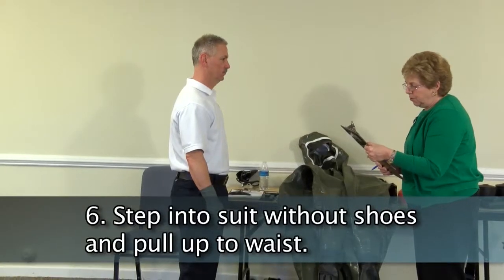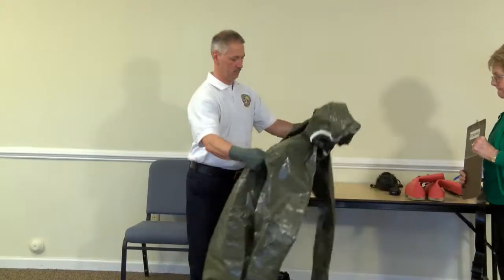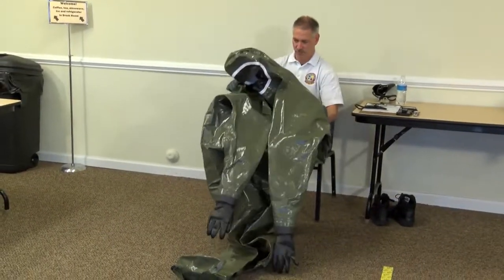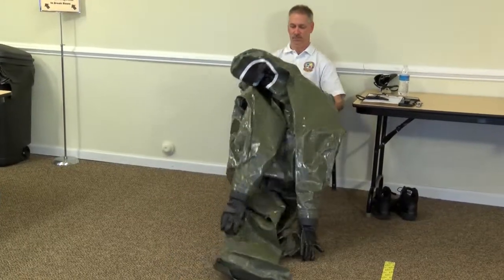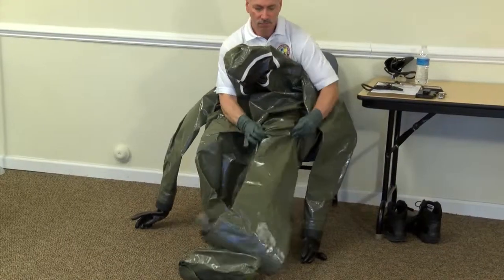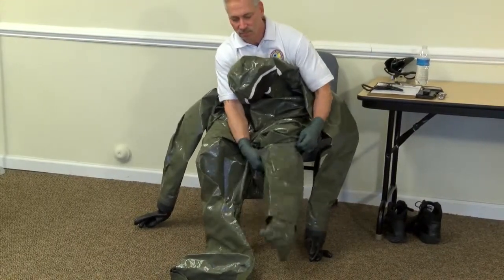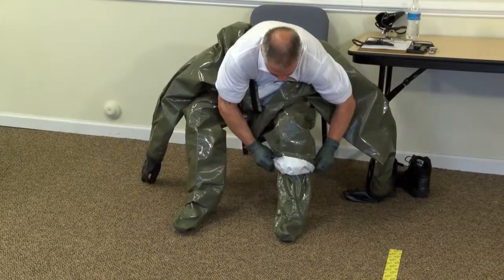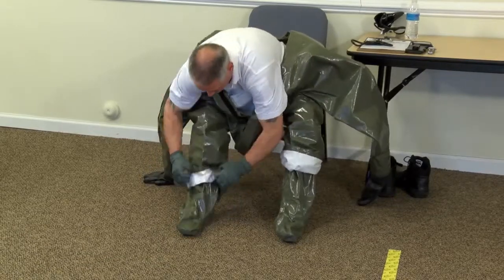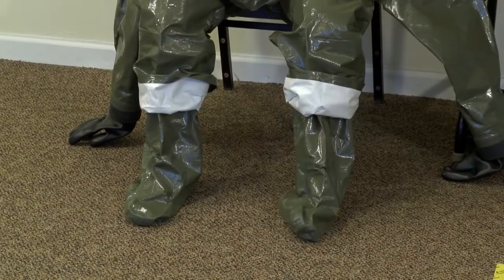Step into the suit without your shoes and pull up to the waist. Suits are available in sizes medium, large, extra large, 2XL, 3XL and 4XL. Typically it is best to choose a suit one size larger than is normally worn. A small suit makes movement and doffing difficult and increases the risk of breach of PPE and exposure. The suit needs to be large enough to allow the worker to bend over, squat, and flex arms without stressing the seams.